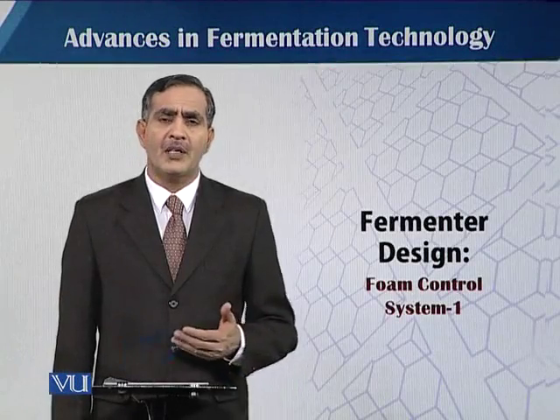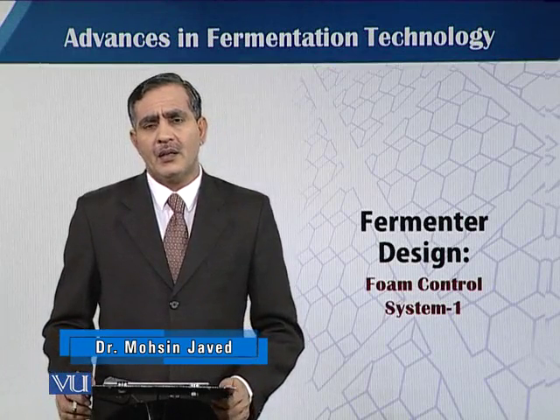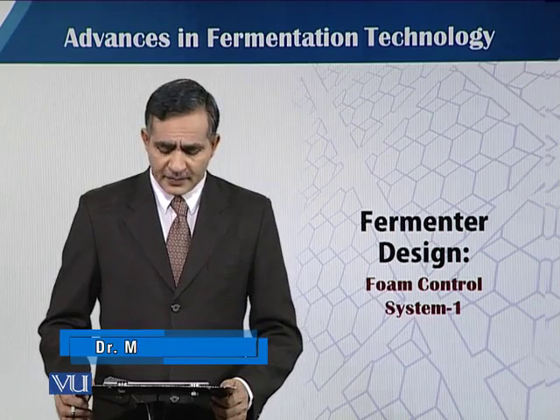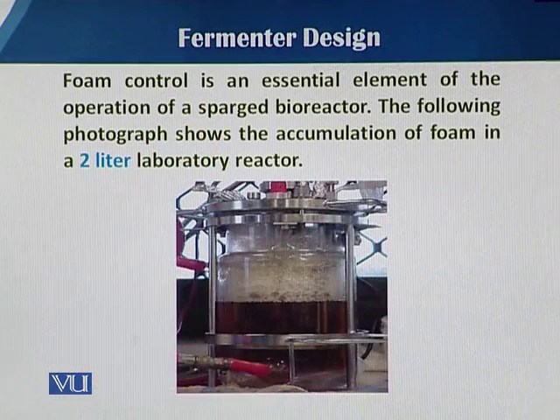In this module, we will talk about the foam control system in the fermentation process, or in a fermenter. While talking about fermenter design, foam control is an essential element of the operation of a sparged bioreactor.